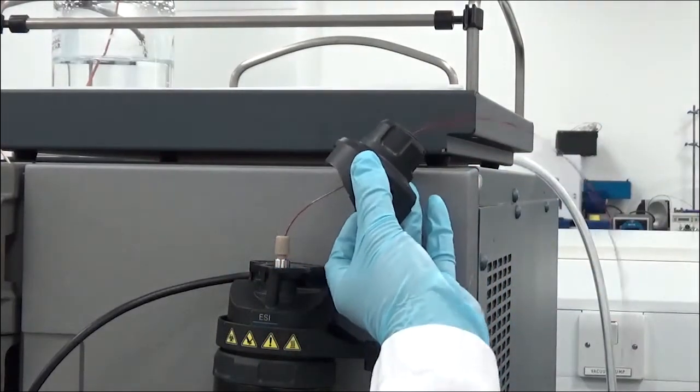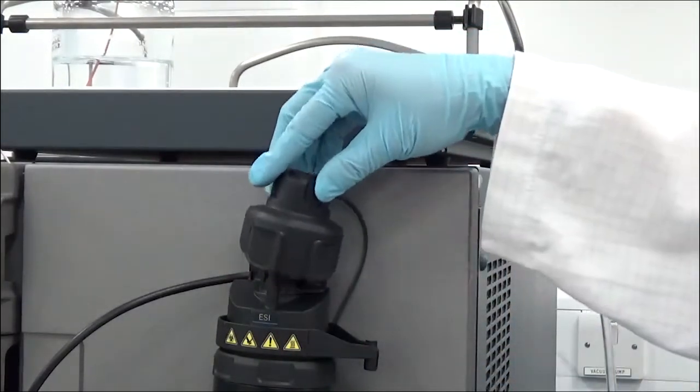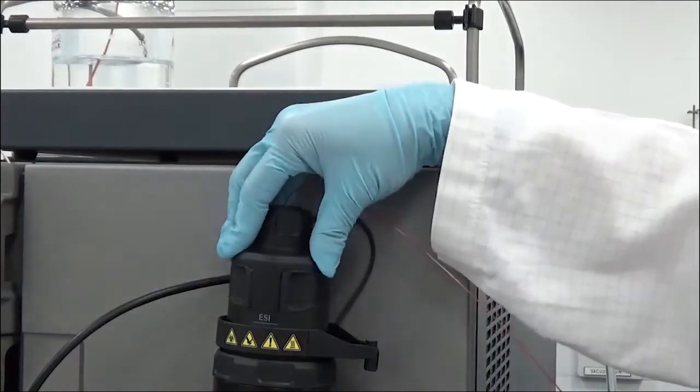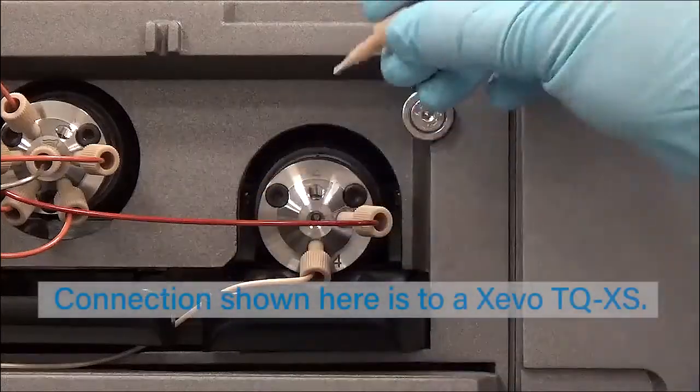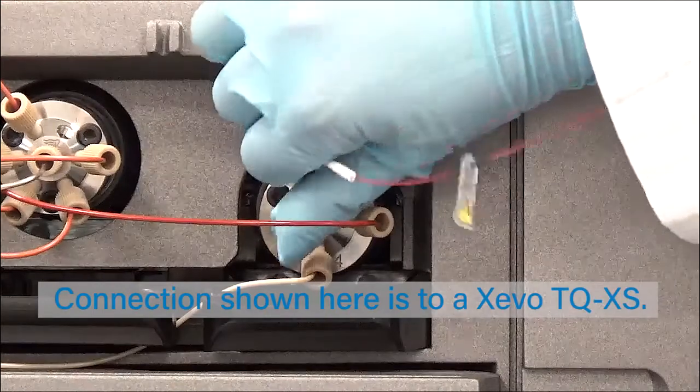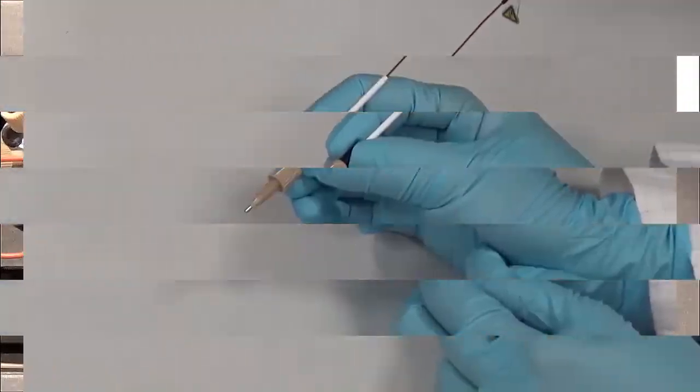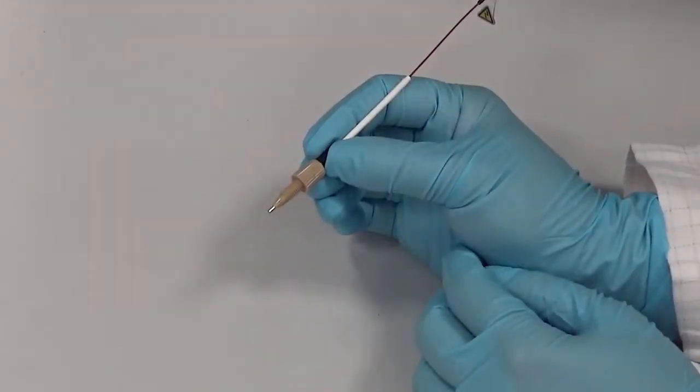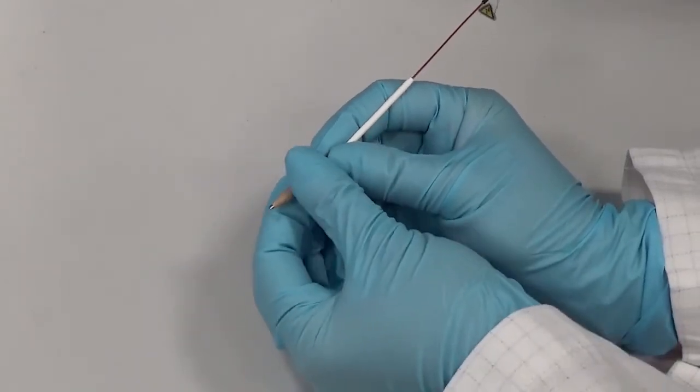Route the probe assembly through the cap and then push the cap onto the probe adapter until it clicks. Connect the inlet fitting to the appropriate port of your inlet system. The fitting can be removed if required for narrow channels or feed-through holes.